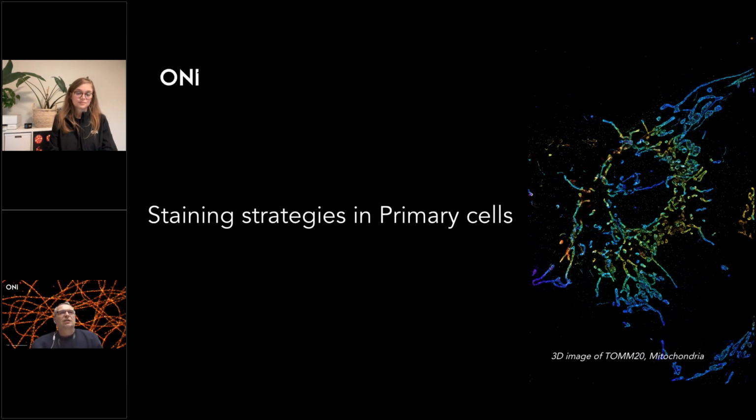So if you use flow cytometry, you have your antibody conjugated to a fluorophore, feel free to use that one. Use the approach of primary directly conjugated. If your protein is very low expressed in the cells, I would recommend to use the secondary approach, where you're using a secondary antibody with the primary antibody.